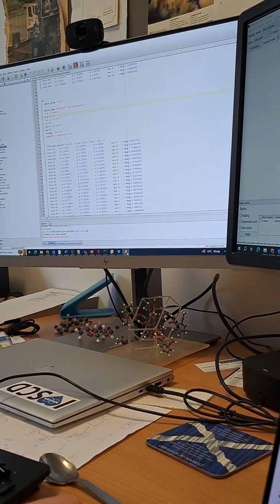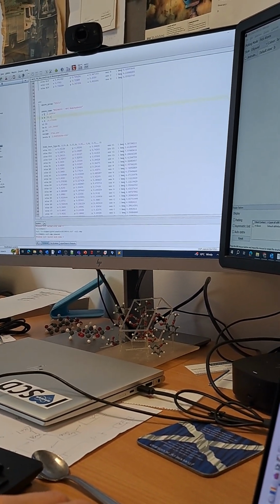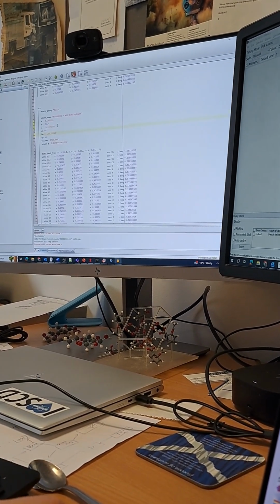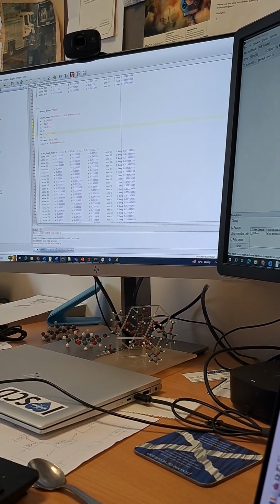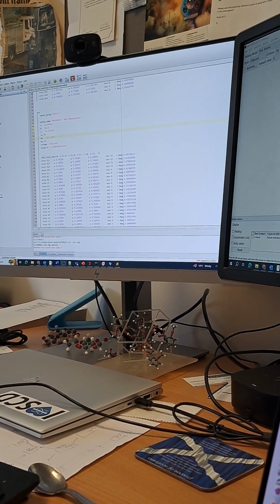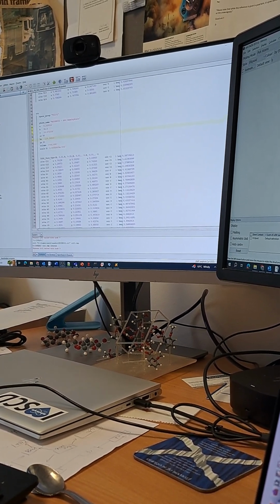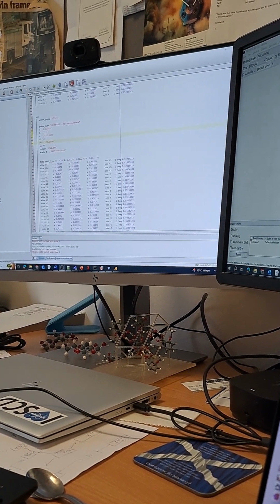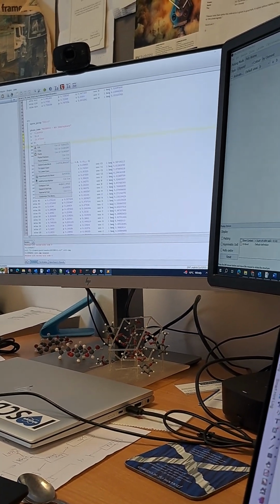So if I click on that, I'm going to take off all these refinement tabs, because we just want to play around with it first of all a little bit. Is that 120 degrees? I'm worried that the angle's gone. Let's get back to some sort of sense of reality.